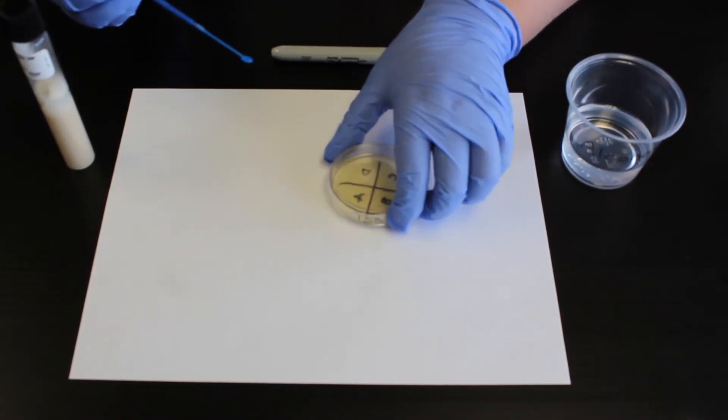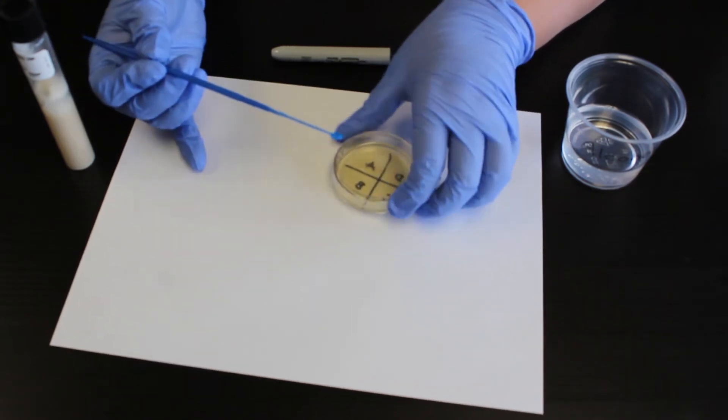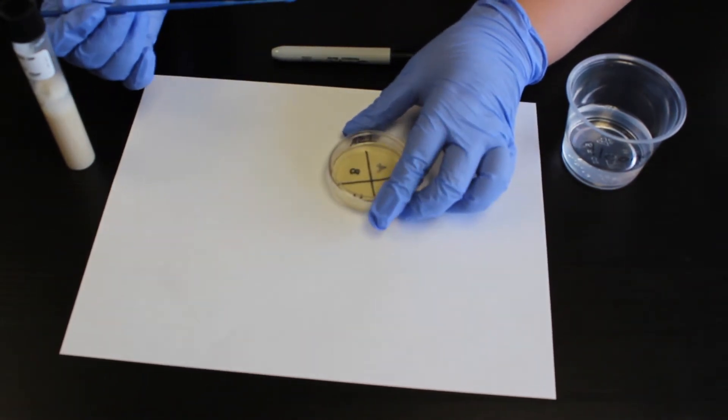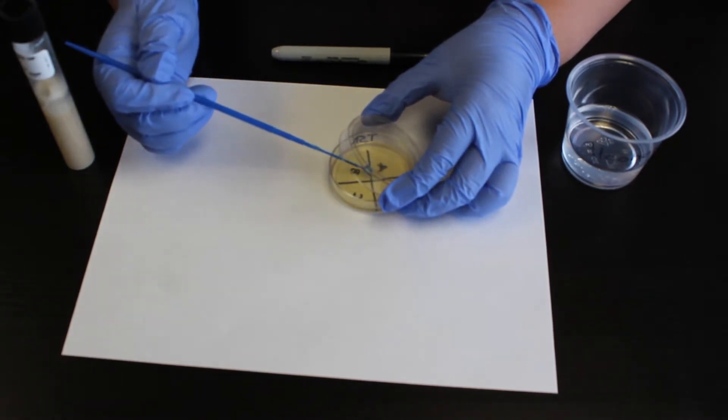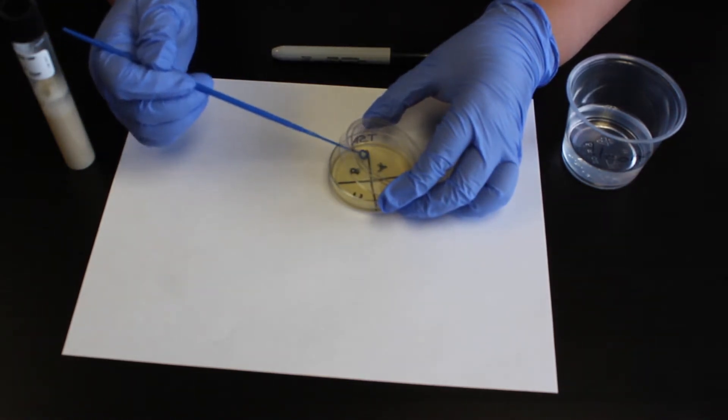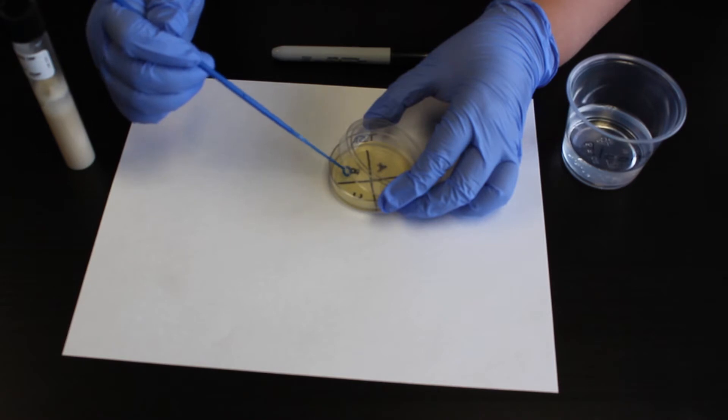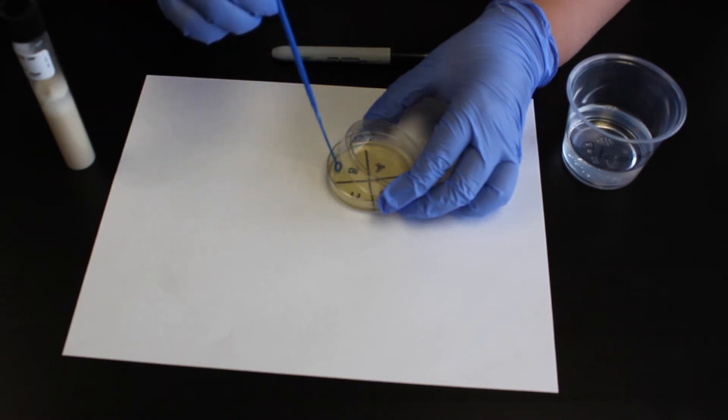While holding the sterile loop in the dominant hand, grasp the agar plate with the other hand, tilting the lid such that a one centimeter space is open above the B quadrant. Pass the loop over the bottom corner of the A quadrant before streaking the B quadrant.